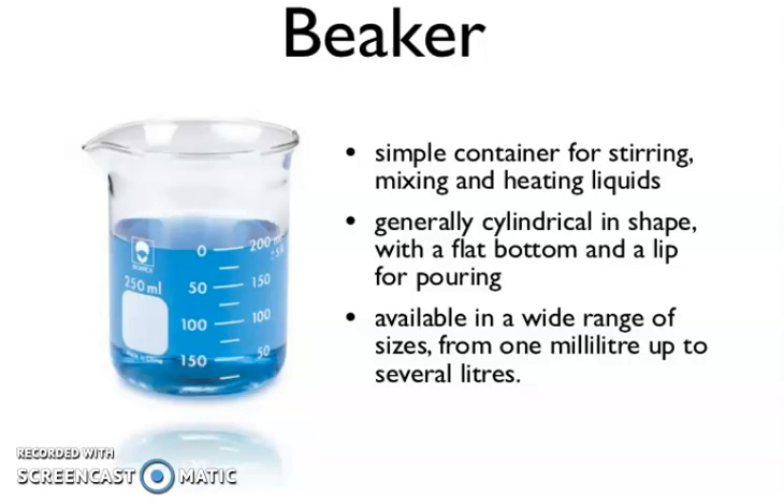First, this is very simple. It is known as a Beaker — a simple container for stirring, mixing, and heating liquids. Generally cylindrical in shape with a flat bottom and a lip for pouring. You can see the lip — this one is a lip. Available in a wide range of sizes from 1 milliliter up to several liters.